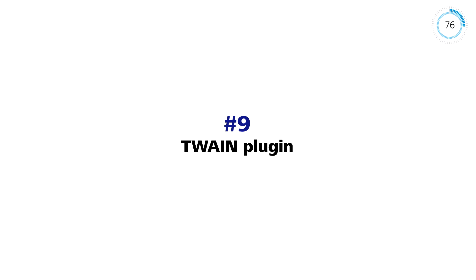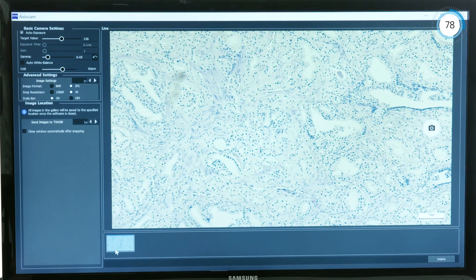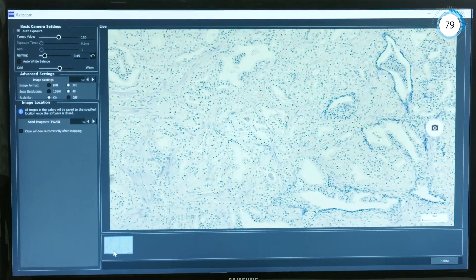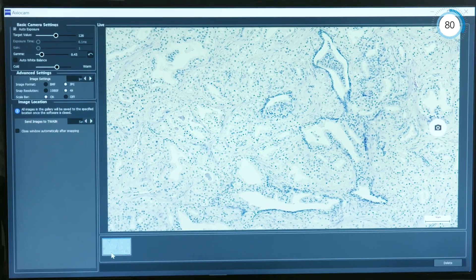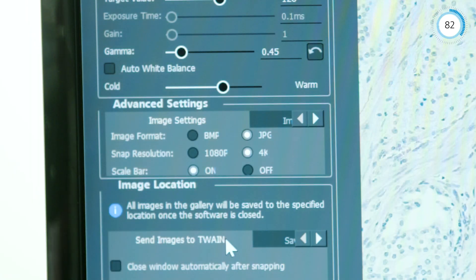With the Twain plug-in, you can acquire microscope images including the correct scale bar with Twain-compatible apps and laboratory information systems.